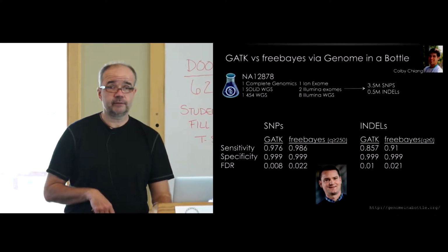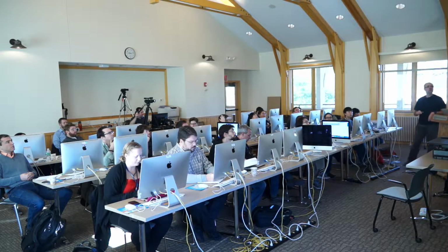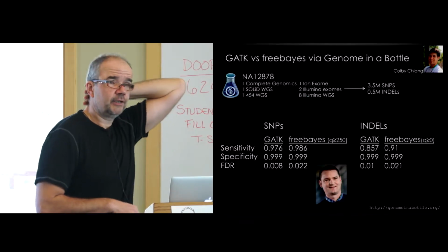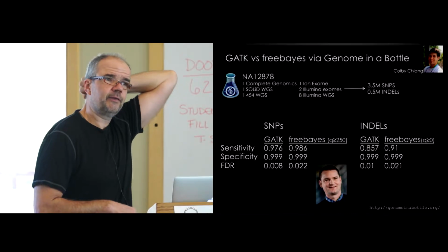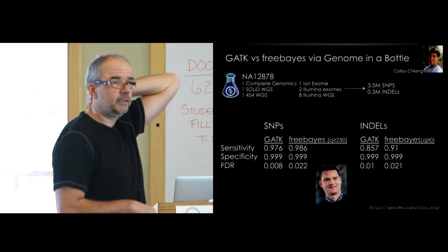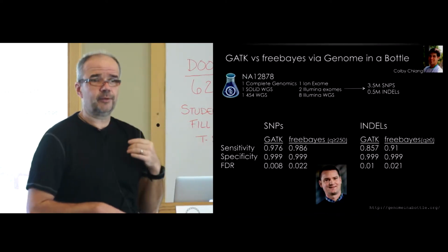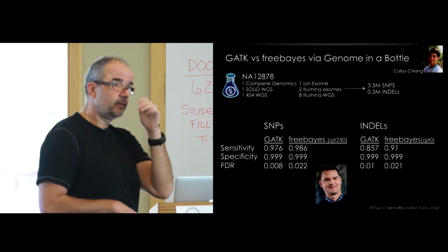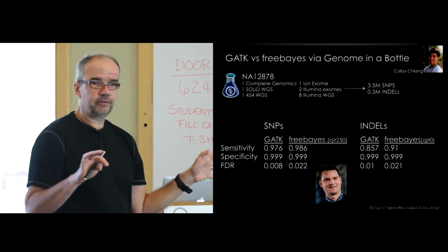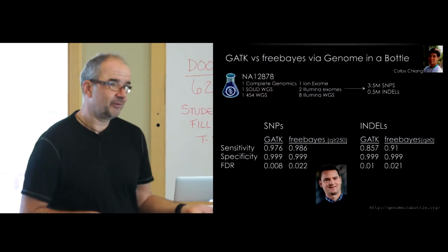Any questions about SNP calling, etc.? Is this data across the genome or the exome? This one was genome. And it's against the Genome in a Bottle, which has a bunch of caveats. Those tend to be the variants that are fairly easy to call anyway. But basically, you have to compare to some sort of truth set. I'm going to talk a little bit about a program that our own Andrew developed that can detect SNPs anywhere. Of course, it's very difficult to then prove that they are real because they're in the most impossible parts of the genome.